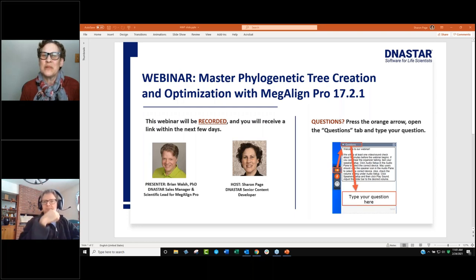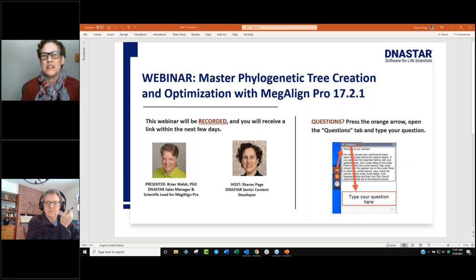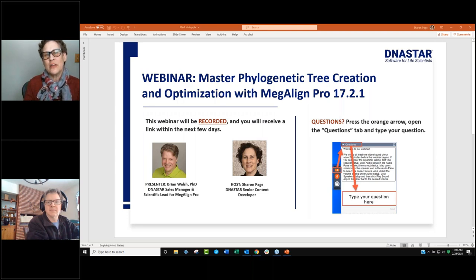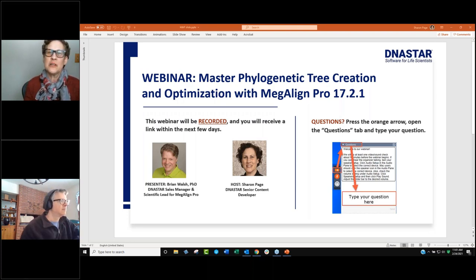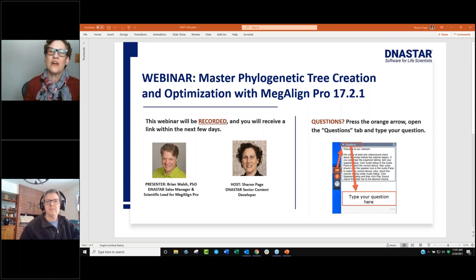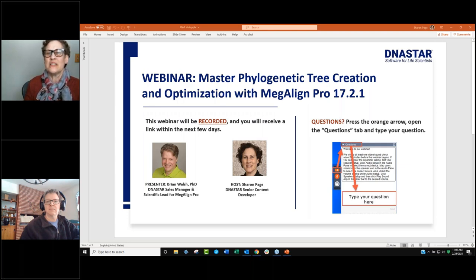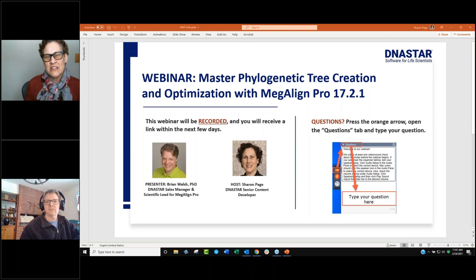Welcome to today's webinar on Mastering Phylogenetic Tree Creation and Optimization with MegAlign Pro. Brian is going to show you from the very beginning how to do a multiple alignment, generate distance statistics, and phylogenetic trees using a bunch of different algorithms and options. He'll explain when to use certain options, then show you how to change the style and balance of the tree before exporting an image for use in a presentation or paper.